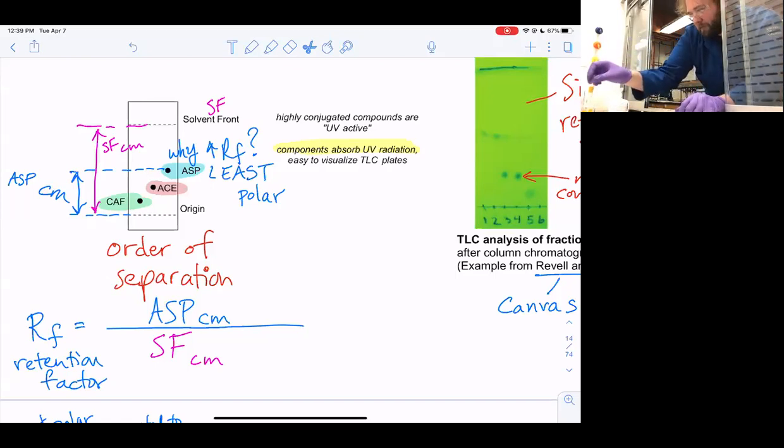The rotary evaporator usually takes about, like, if you have the temperature and the pressure right, about 5 minutes. A little longer if it's something a little more difficult, like toluene. But here you go. So you have a nice little white crystals. Sorry, I'll let you know specifically if you're ready to spot it. Okay, well, I can pause for a few seconds if you need. Caffeine doesn't want to.